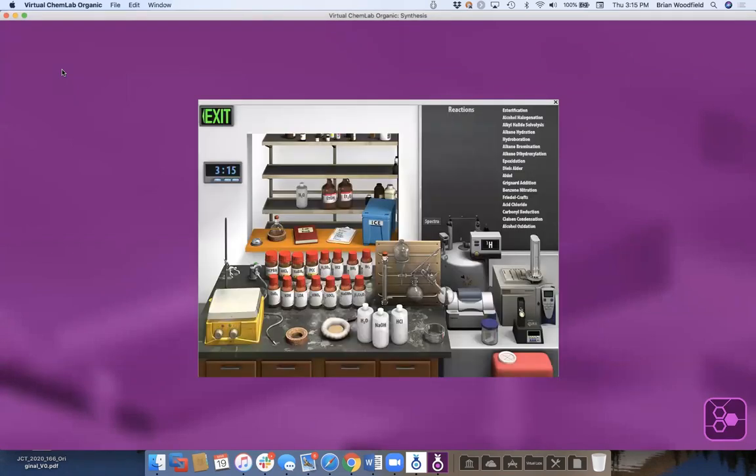synthesis. So I'm going to give you a warning here in that I may be a chemist, but I'm not an organic chemist. I'm a materials chemist and do solid state physics. So I know a few examples, but if you have organic chemistry questions, email me and I will pass those along to my colleague, Merritt Andrus, who helped me develop this lab so many years ago.